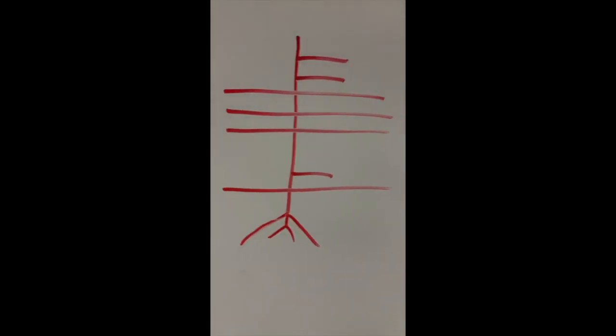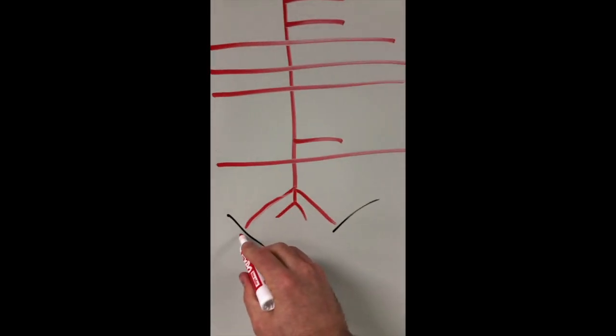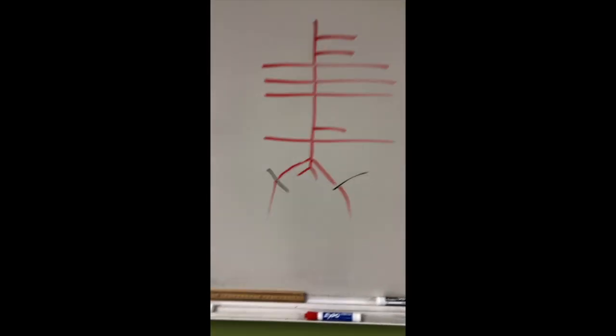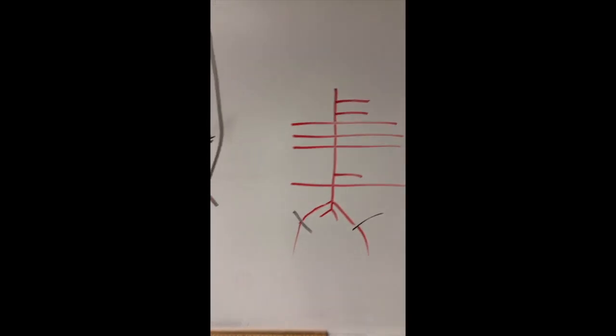And then at this point, there's kind of an inguinal ligament that it passes out of the abdominal cavity, and once it passes out of that cavity and into the legs, the external iliac artery becomes the femoral artery. So you just think of that as feeding the legs right there. So if you can draw this on test day, I think everything else in the abdominal cavity should start to make sense as we connect up the rest of these landmarks right here.